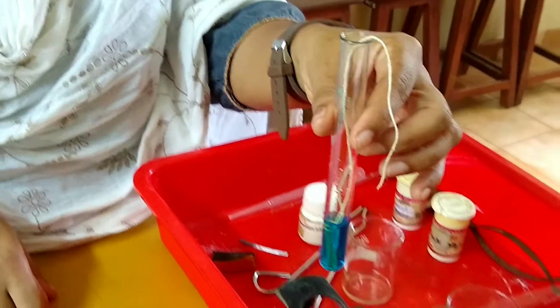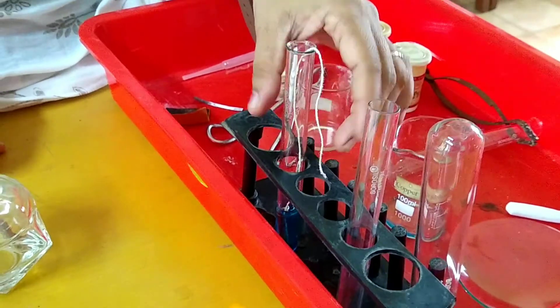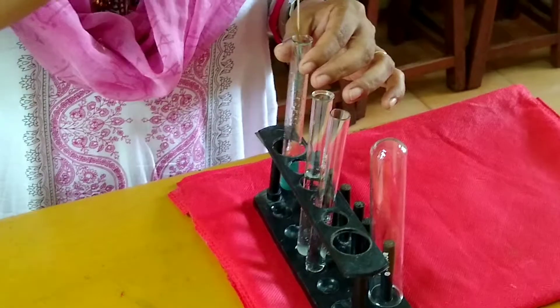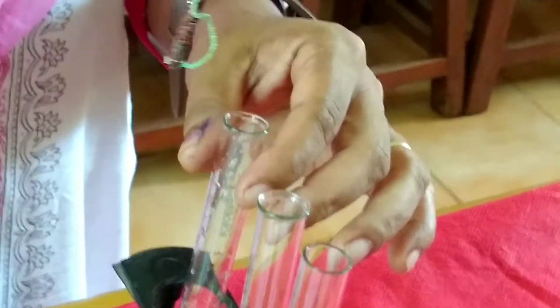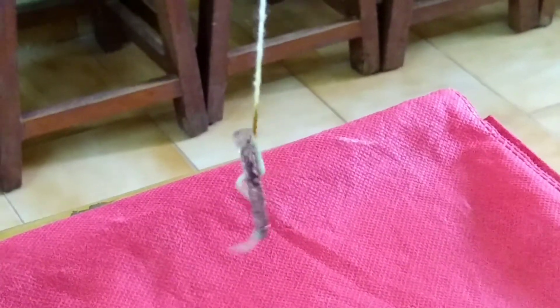Let us keep it in the test tube stand for the reaction to take place. After the reaction, you can see the iron nail is coated with a layer of reddish copper. So in this reaction, iron displaces copper.